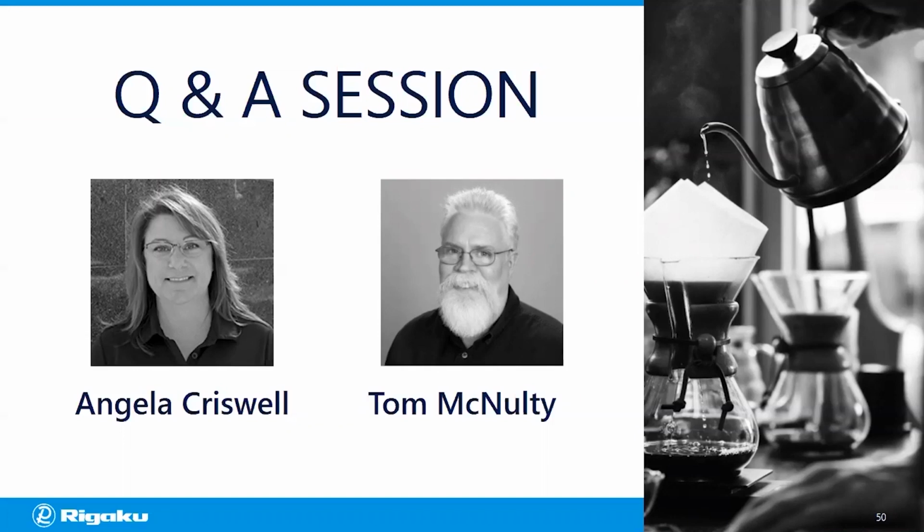Correct. So Keith has a comment, says hi, Angela, and he's letting you know they use iodine, Lugol solution, or phosphotungstic acid, and he says they are common contrast agents. So thanks, Keith. Yeah, and by the way, I did purchase some Lugol solution based on what I read from one of your papers, and I'm trying it. I'm wondering if I need to back soak or those types of things. So like I said, it would be great to have a webinar topic just dedicated to that.